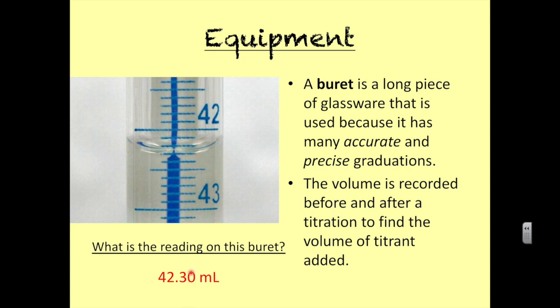And that's crucial to this. So you actually get 4 sig figs off of this burette and count on that, and you'll be tested on that.